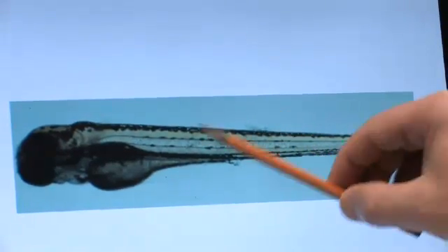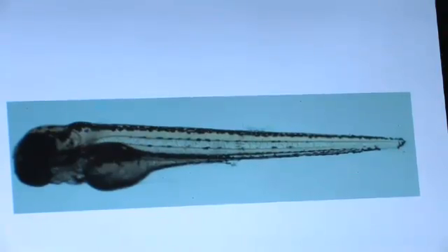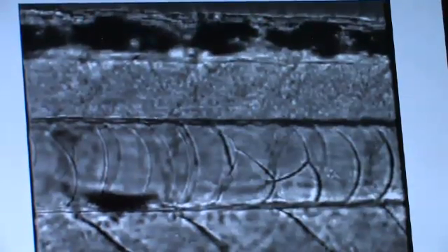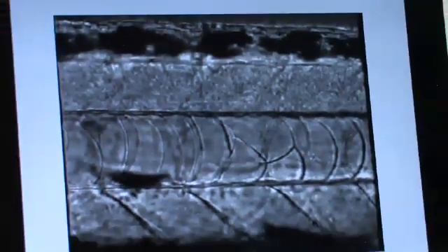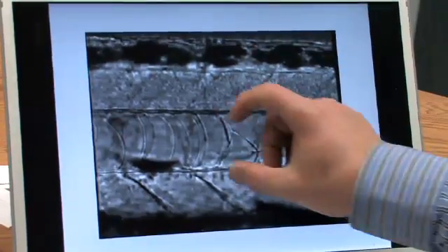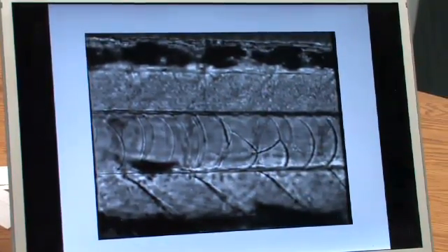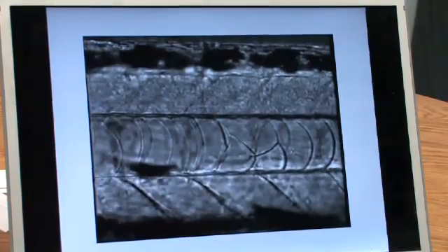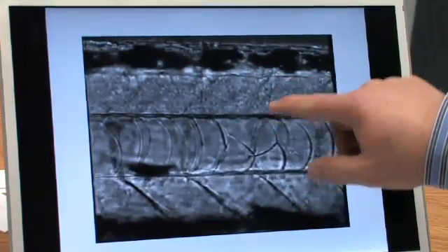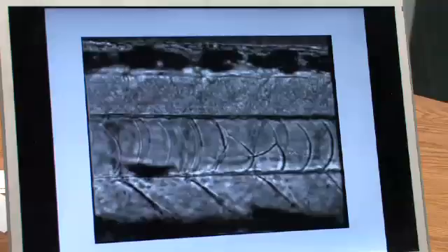If we zoom up on the tail region of the fish, we can see the transparency. This is a movie of a fish, this is the spinal cord here and the notochord there. If I animate the movie, you'll see that we can actually see the blood cells flowing through the capillaries in the nervous system of the fish. This transparency is what allows us to look at the structure of neurons and evaluate the effect of treatments on restoring the ability of the nerve cells to regrow.